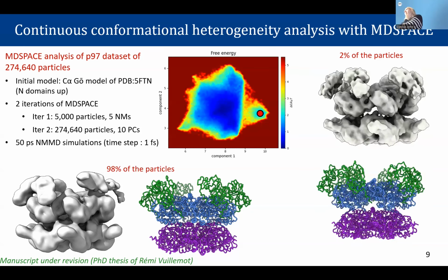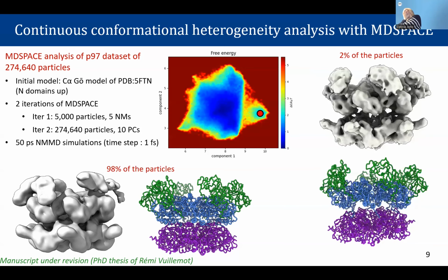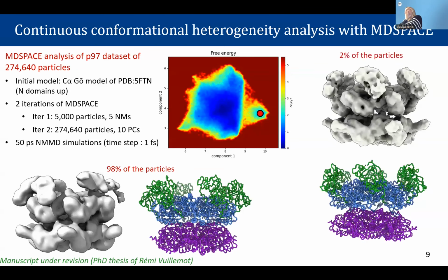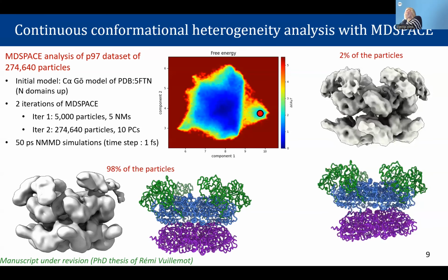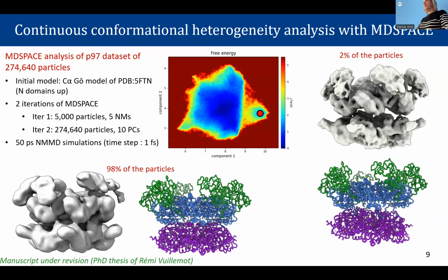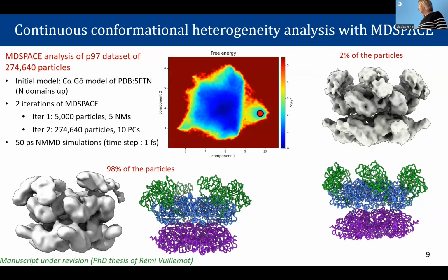Yeah, but the second question, just to be clear, in cryo-EM you see through the objects as in an X-ray. It's not as though you are taking pictures. So you don't have occlusion, and no. This is what allows you to get highly non-convex objects. Yeah, you see through, you have a projection. It's an integration actually of the density along the electron beam.